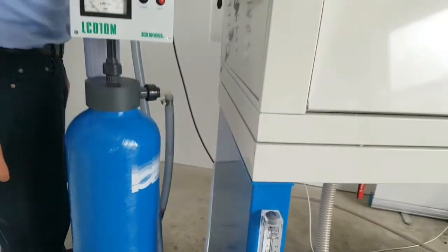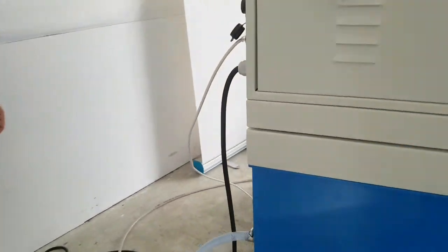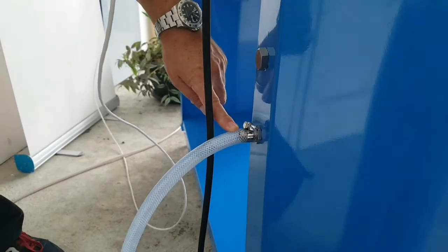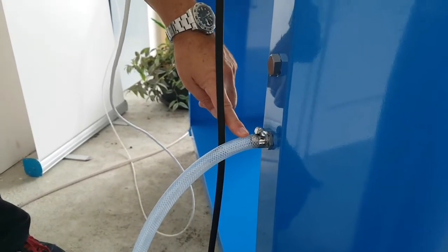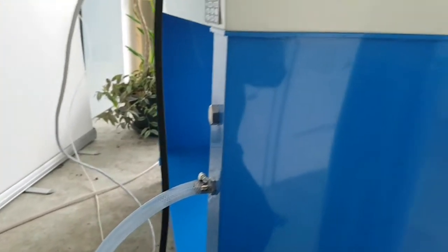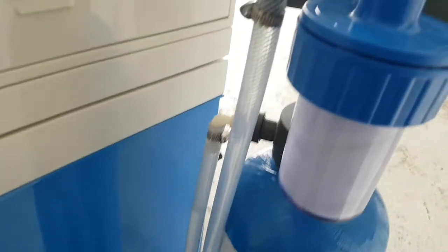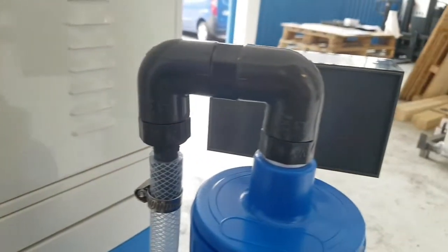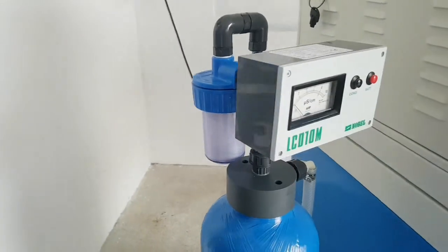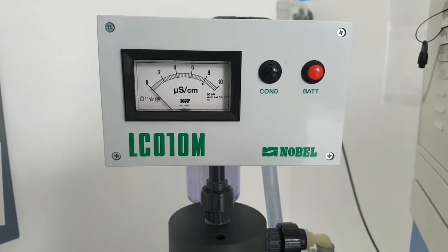In the back there is the water connection, so you can connect to your network or pass through the mineralizer system — this one is an option you can also buy locally. This is a water demineralizer system.